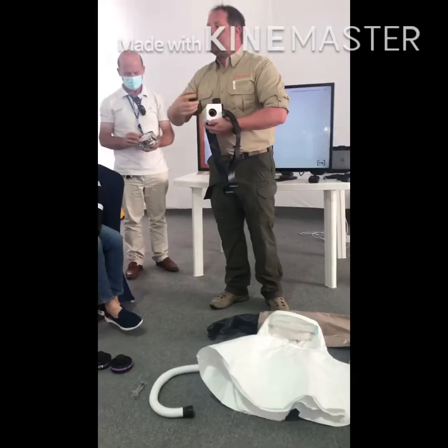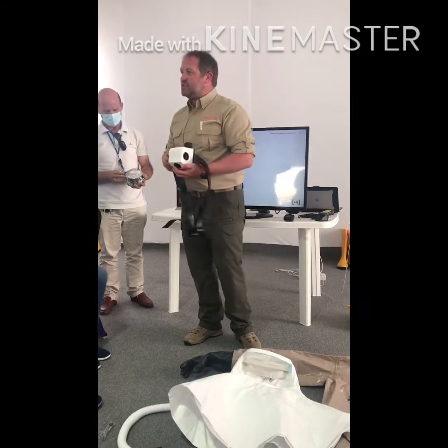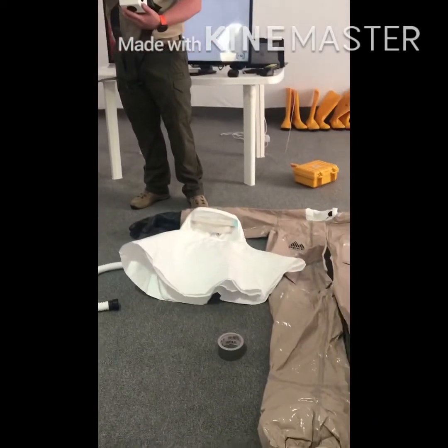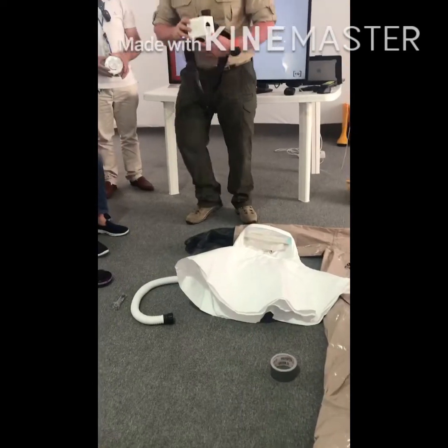One thing I will say to you is if I arrive on scene and somebody says to me, I've already checked that, it works, I don't believe them. I always check my own equipment, okay? Because it's my life, isn't it? Yeah? So I then take my canisters.